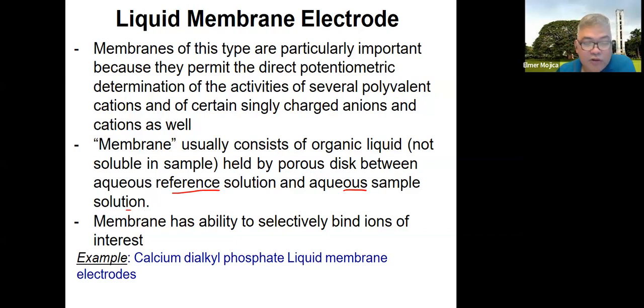This type of liquid membrane is formed from immiscible liquid that selectively binds some ions. The membrane has the ability to selectively bind ions of interest.